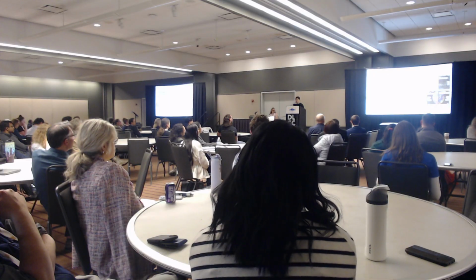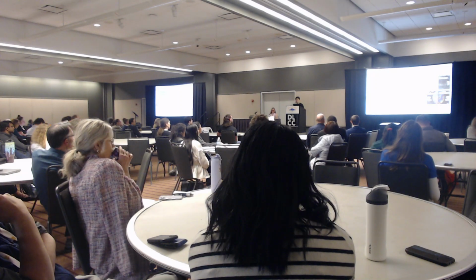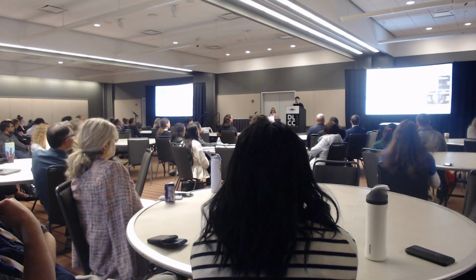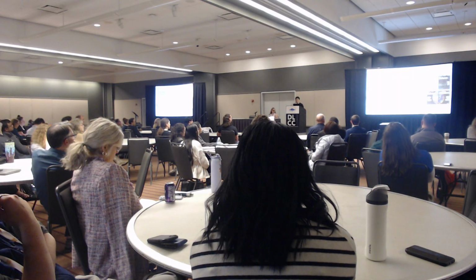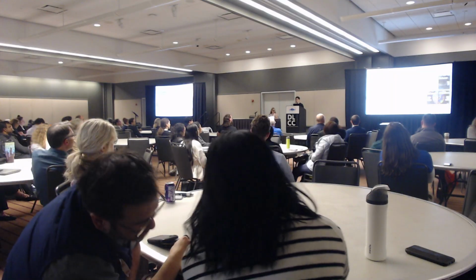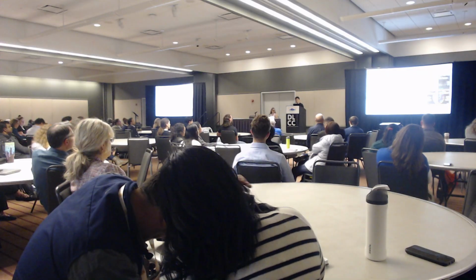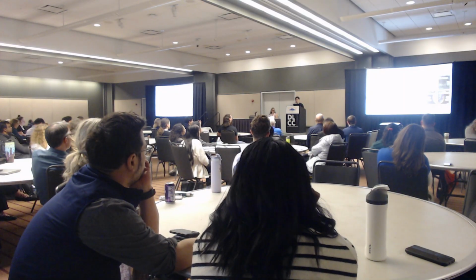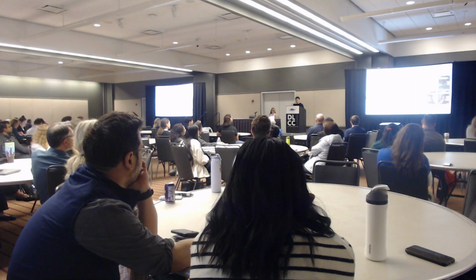This technology is very successful, and we generate a lot of single-cell multi-omics profiles from different tissue types and species. However, as we can see, this technology has some limitations. For example, the microfluidic devices have a relatively low capture rate, which means that we will lose a lot of cells, and also the dissociation process may introduce some artifacts. And some cells are also very fragile, and the dissociation process will lose those cell populations. More importantly, we will lose the spatial information, which is important to understand the biological process within the tissue sections.